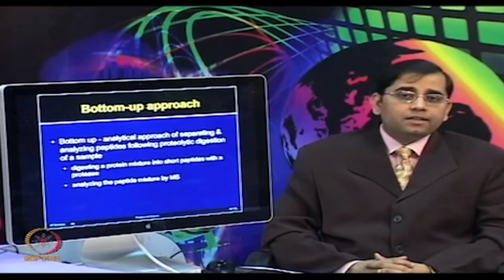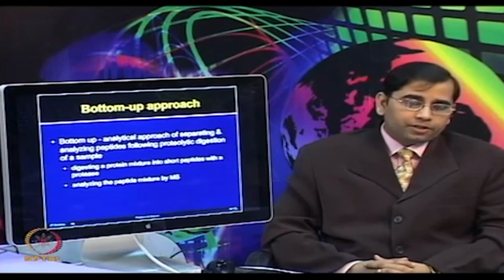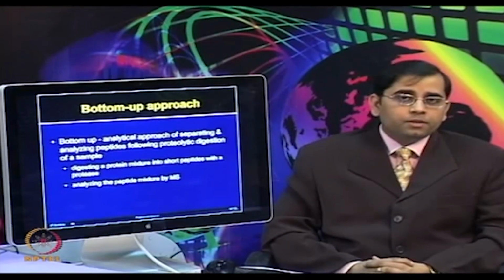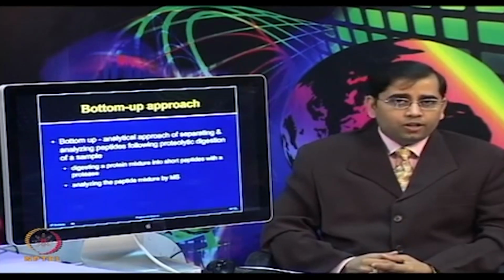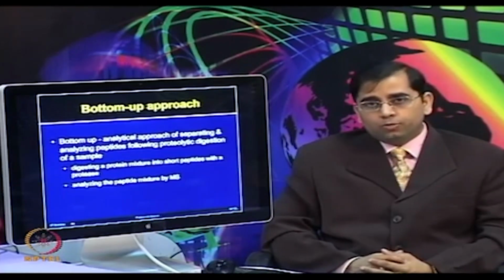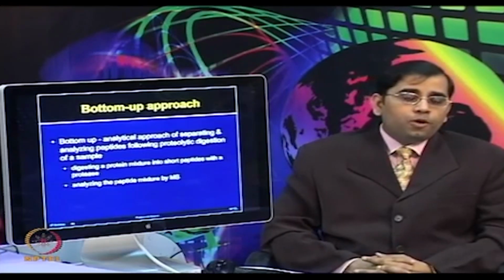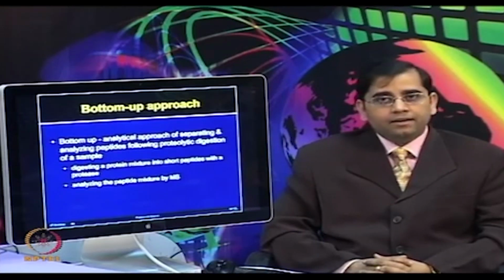The advantage of this approach is that one can obtain more sensitivity and higher proteome coverage. The disadvantages include that the information about the protein isoforms is lost, and also it is unable to distinguish very close sequence homologs. So, both top down and bottom up approaches have their own advantages and disadvantages.